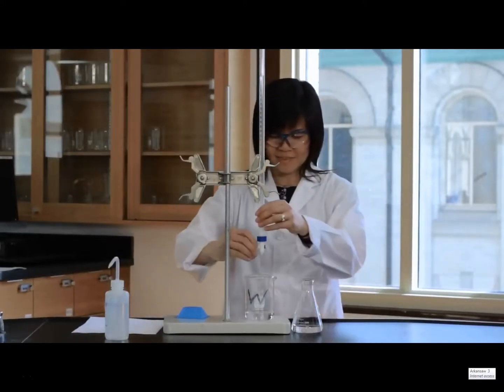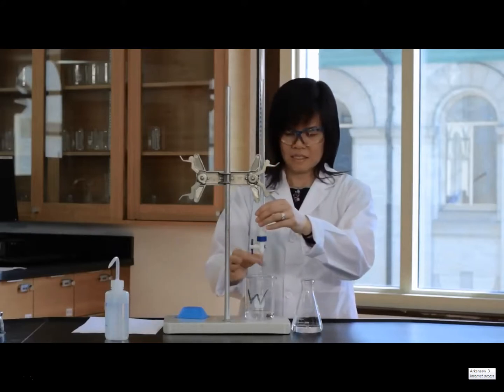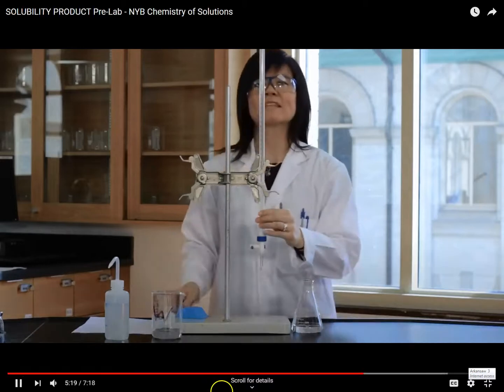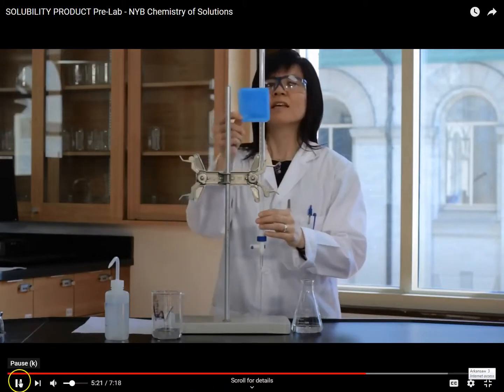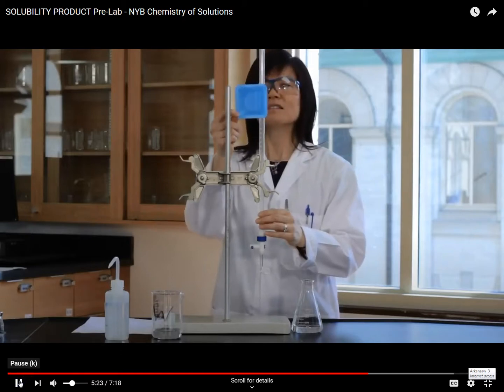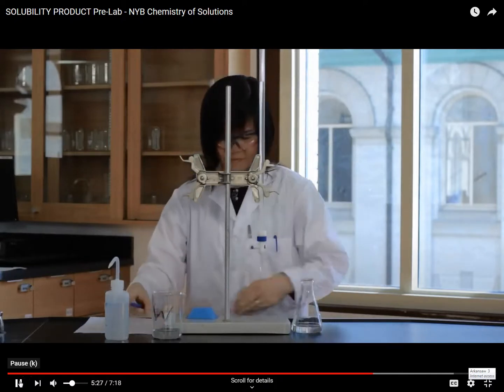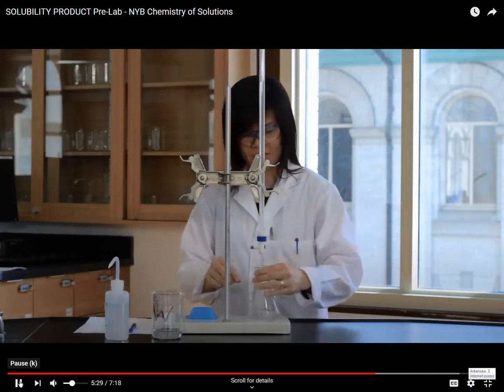So there's a waste container. She's going to take the air bubbles out at the bottom and flick it with her finger, get all the air bubbles out, and measure the starting point to 2 decimal places. This is our initial volume that you'll see in the lab, the initial volume.